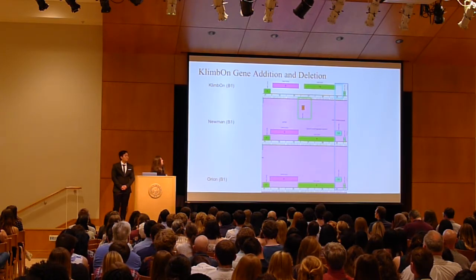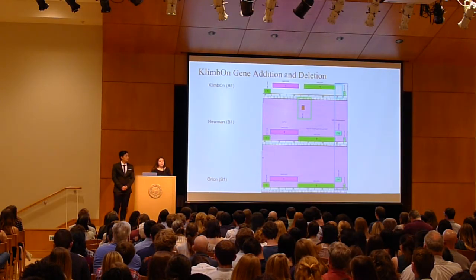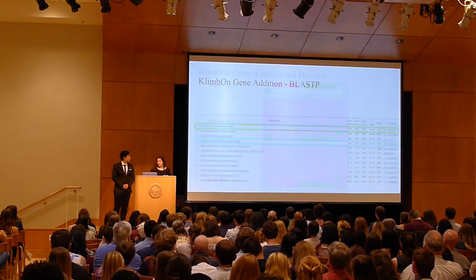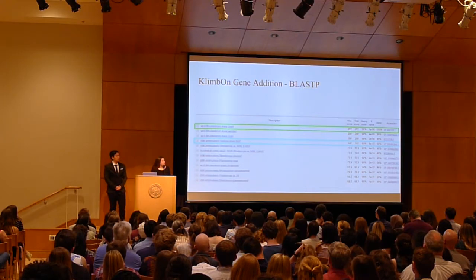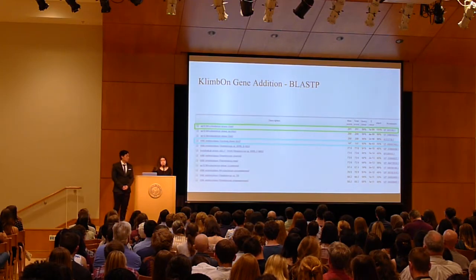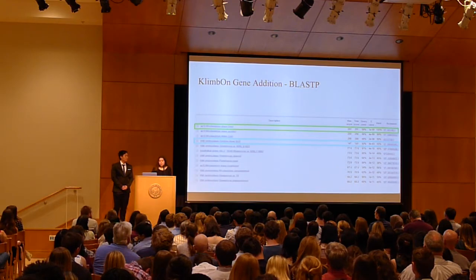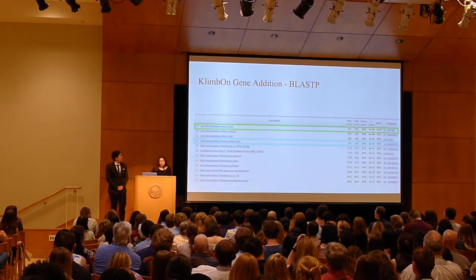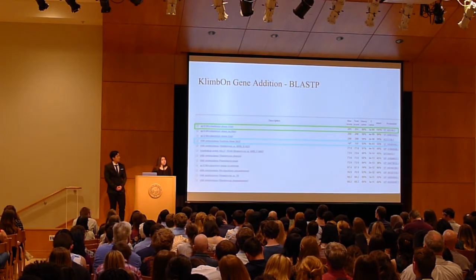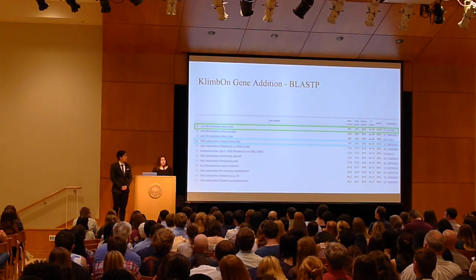So then what we did was we took the nucleotide sequence and converted it to an amino acid sequence and blasted it and got a function for it. In the green box at the top, it shows that it is also called in other B1 cluster phages, with a good e-value and good query cover. And the blue box lower down actually shows a possible function for the gene. So after taking all that information into consideration, it was decided that we would add that gene, which DNA Master and all the other programs didn't do automatically.